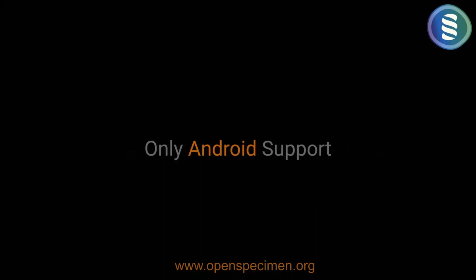I know a lot of people use iPhones and Apple phones, but the reason we currently support only Android is, one, lab devices are different from personal devices. This could potentially involve PHI and things like that. So I don't think your personal iPhones can be used to connect to your OpenSpecimen and log in. That would not be a good idea from a HIPAA and security point of view.